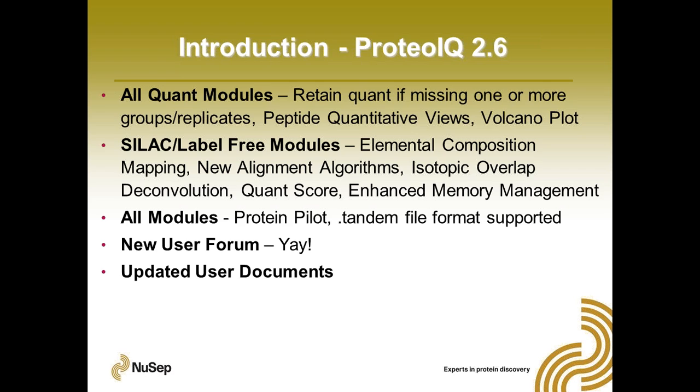We're also supporting a new form of XTandem, and that is the .tandem file. That is generated when you search XTandem through the transproteomic pipeline, so you can now bring that in. Big news, also, we have a new user forum. So we have now a place for you to go, ask questions, share information with each other, and recommend new features you'd like to see. There's also a place in there for you to submit ticket requests. So if you need help on something, you can submit a private request and track their progress as you go through the support process. Okay?